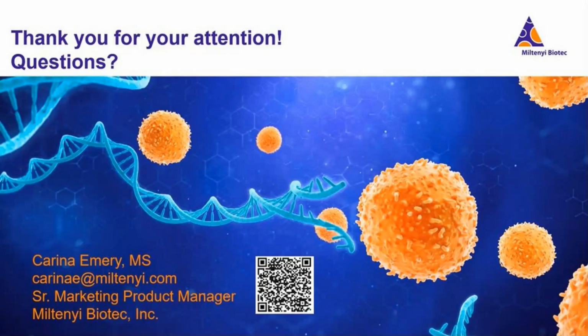So I can't say anything from Miltenyi because we haven't had a chance to validate it internally, but it does seem like some people are having success adding transcriptional inhibitors to the dissociation mixture, and from what I can gather, it doesn't seem to be inhibiting the efficiency of the dissociation. People are still getting the yield of cells that they're satisfied with. I think it's really interesting, and we're working on it internally, so hopefully we'll have more to say later.